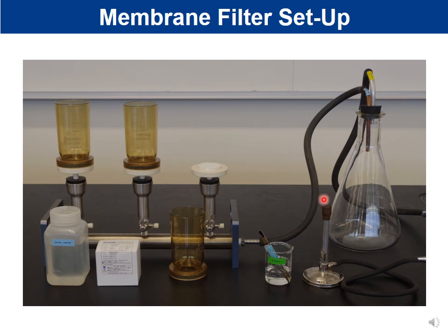And so when you do this, you would have your Bunsen burner on, and you would want to make sure that you have your blue inner cone, right? Because that's going to be the hottest part of your flame. And you would need to take your forceps that are dipped in alcohol, and you would flame sterilize them.